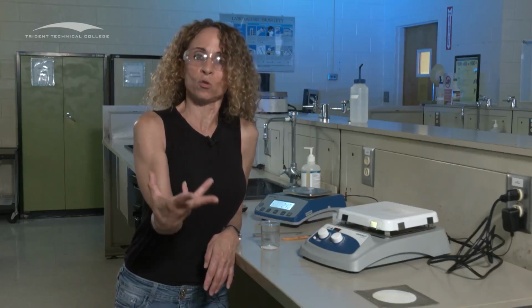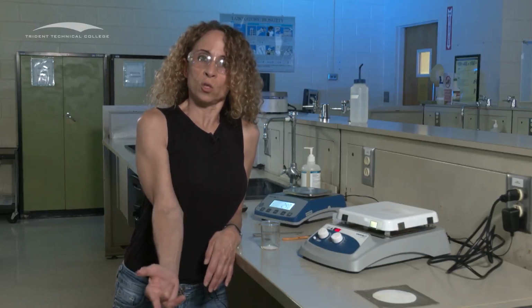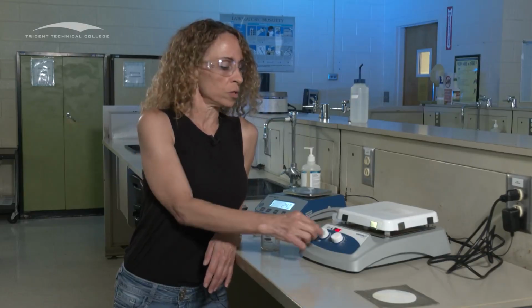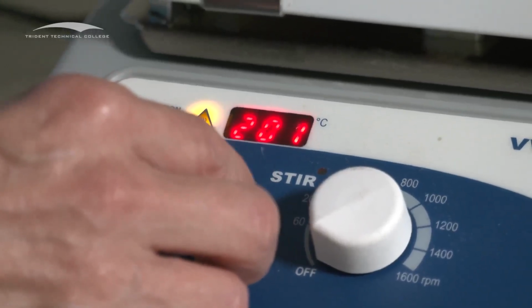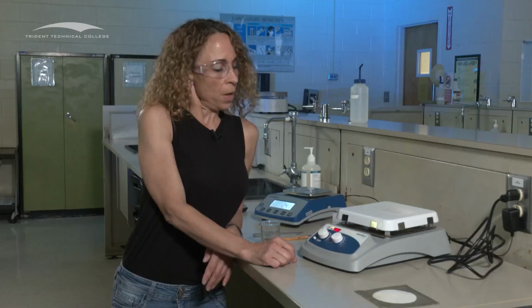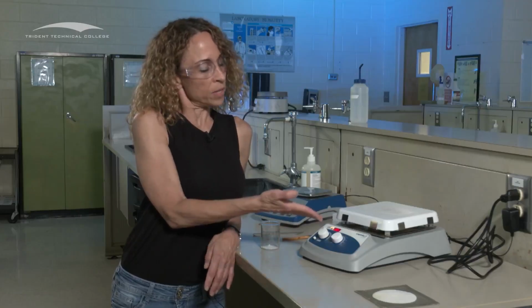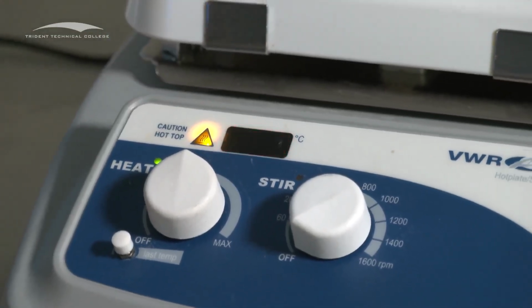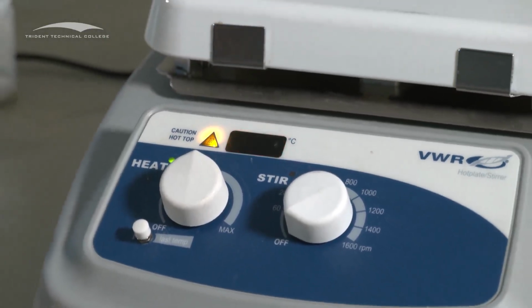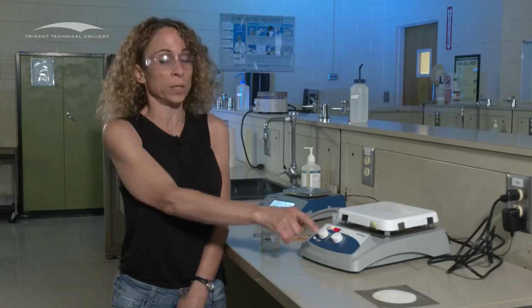All right, so you're going to turn this and look at the protocol, the experimental procedure, to see exactly what setting you're going to start. For the alum and the baking soda lab, you're starting at 200 degrees. So you just adjust this to 200 degrees. Okay, 201. Okay, and now you're going to give it a moment. It's flashing. When it stops flashing, that means the temperature has reached that point.